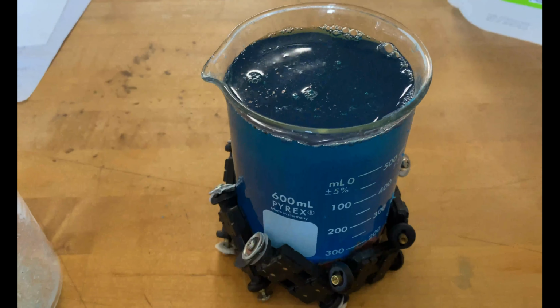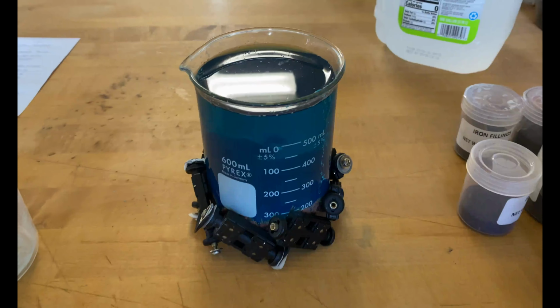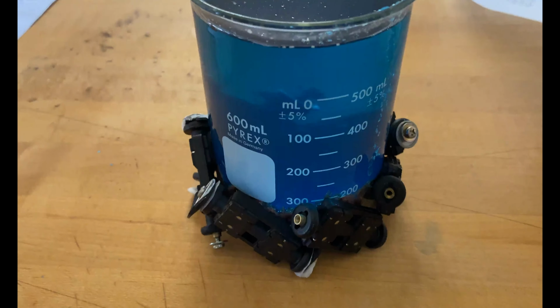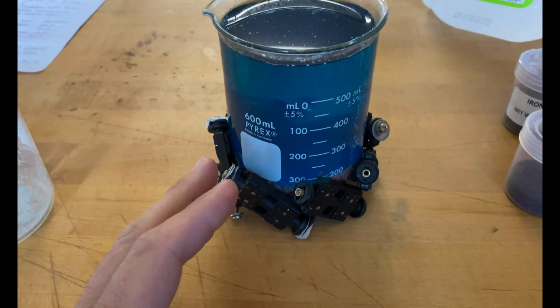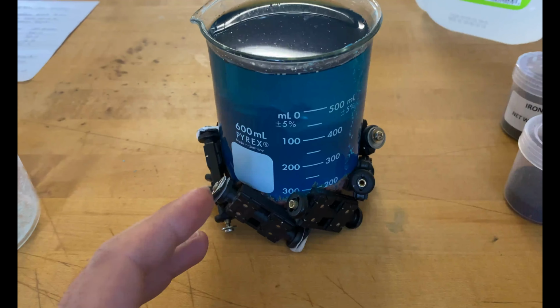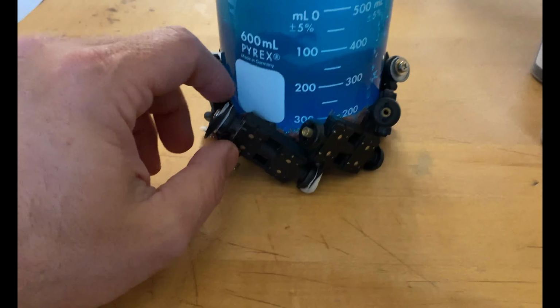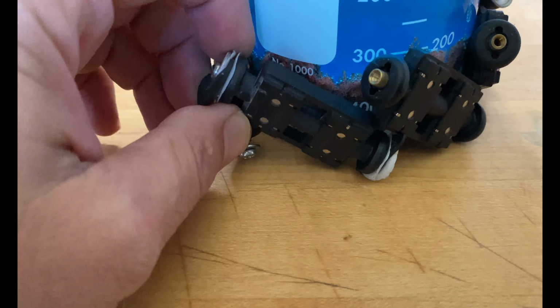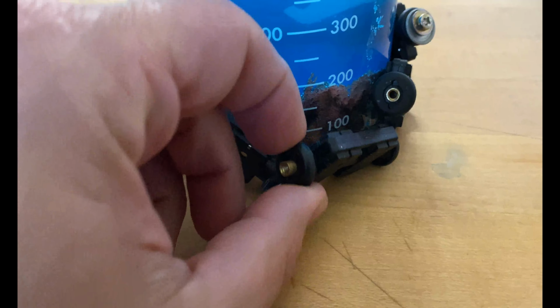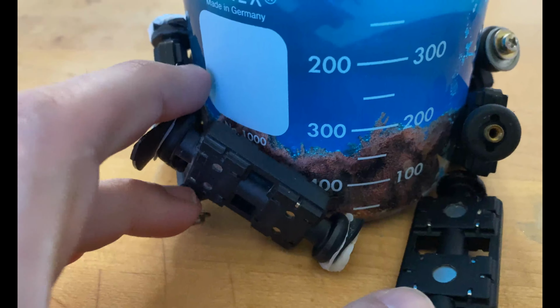And then we'll just let the reaction continue. Okay, it's been another hour or so. And even though this is plenty of blue vitriol for the stoichiometric balance, I think I'm kind of headed the wrong direction here. I think the majority of the displacement around the magnetic field has already happened, because when I remove these, it looks as though the shape stays, right?